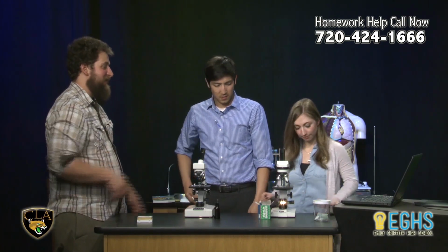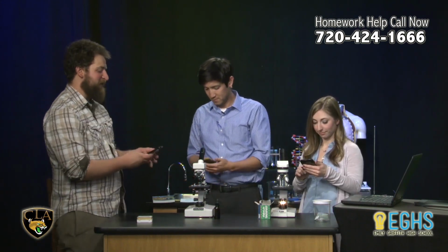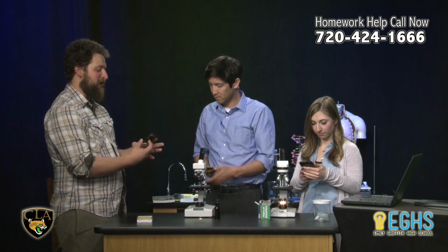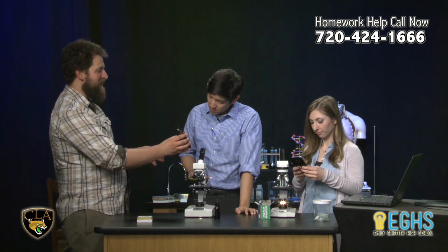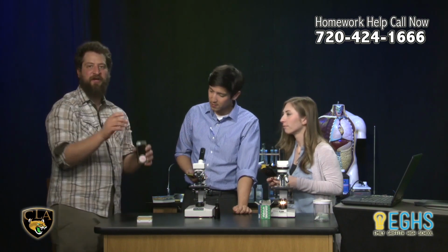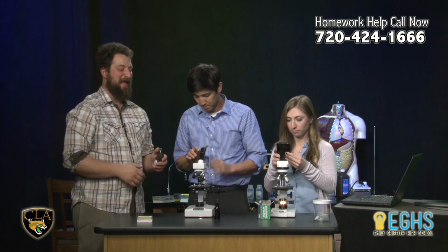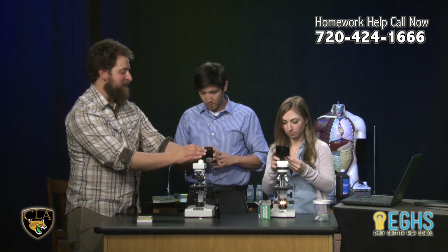Okay, so now photographing. This is the tricky thing. Smartphones are actually surprisingly good at capturing these images. I have an image right here, which I'll just show to you guys. So there's a level of focus that we can get. Okay, pull up your cameras, and what we're going to do is point the camera right down the barrel. It cannot be directly against the piece here.